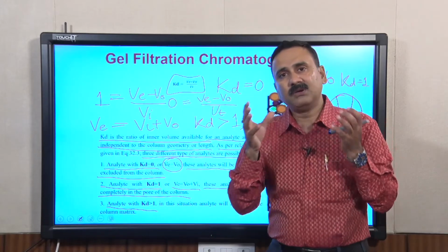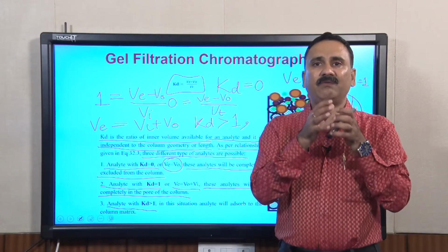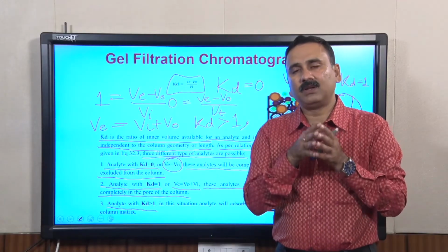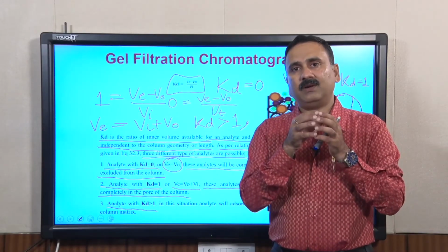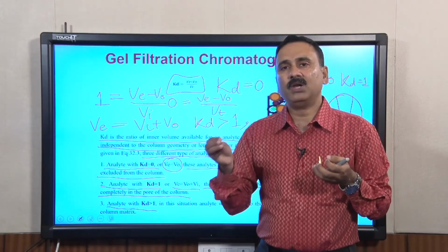That is why most of the beads people use in gel filtration do not have any kind of affinity or preferences or any kind of association with the molecules.